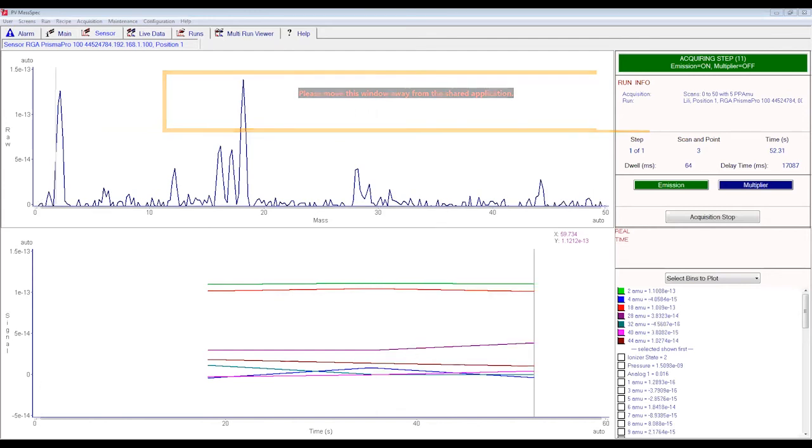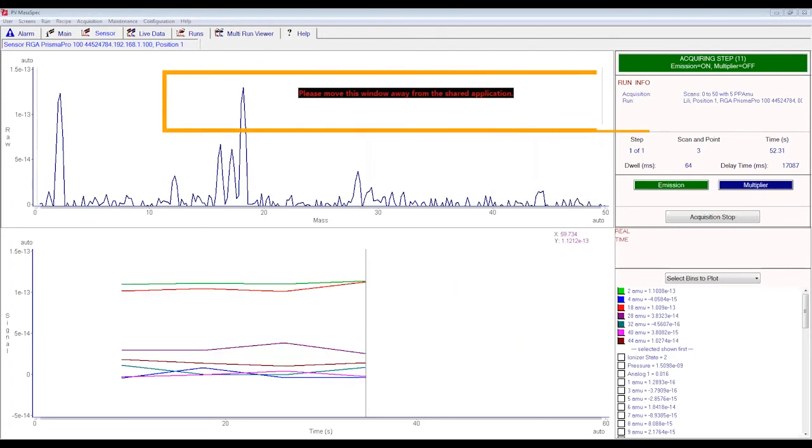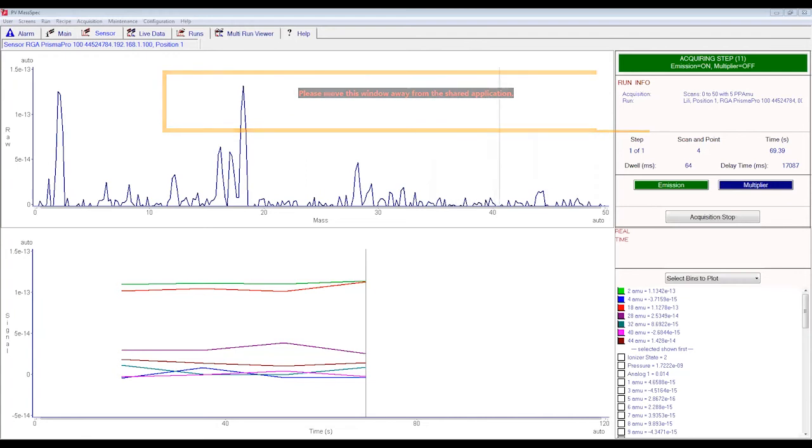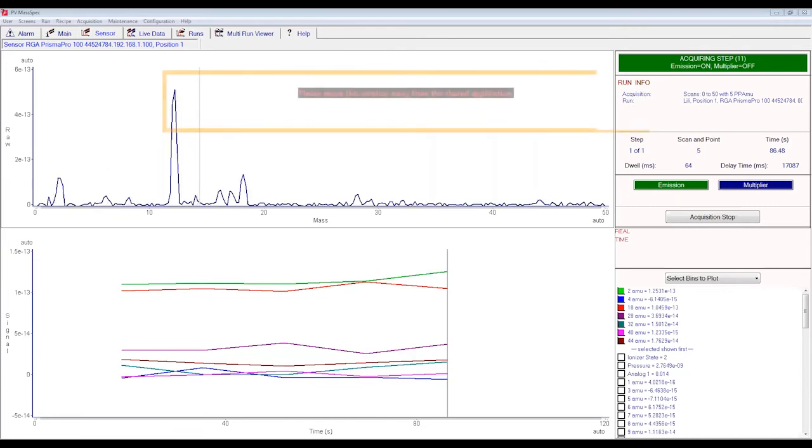But just a second. So this is only an additional measurement, but it's not really giving the information of whether something is being desorbed on the sample. It's only a small amount that enters the analyzer. Yeah, only a small amount, and of course there is a big background from the remaining gas which does not interact. Of course, if your sample is very highly reactive, so it converts almost all the CO, for example, which comes to the surface, you have quite a good signal from CO2, everything is fine, so you can do this analysis.